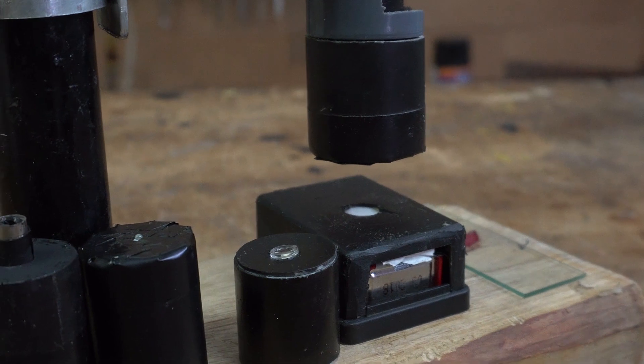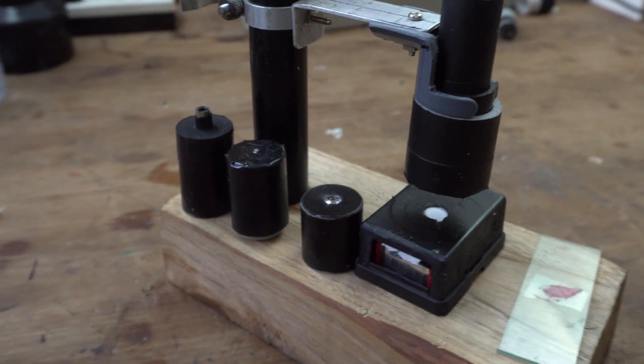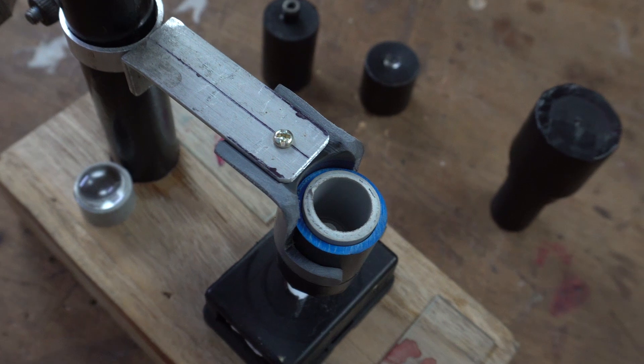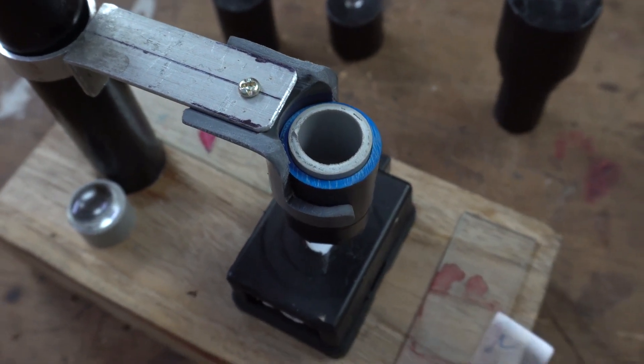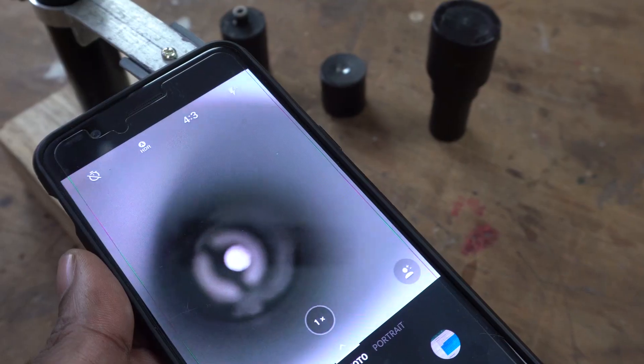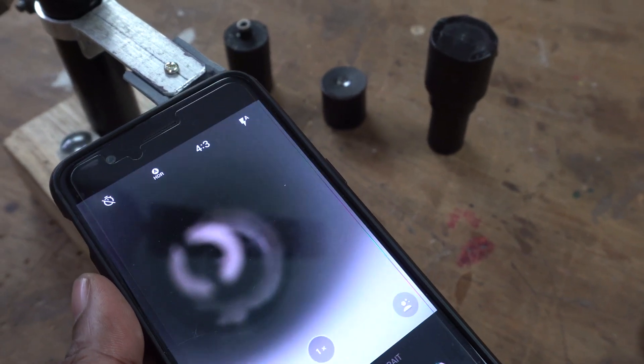Considering most of its parts are salvaged, this is one of the low cost but really educational projects. One upgrade could be made — adding a variable resistor in the light source to adjust its intensity — but I just added some papers in there. Unfortunately, I will not be able to show you what I see through the microscope on screen because the mobile phone does not do a good job of capturing the images through this microscope, and that may be because of the shape of the microscope itself. I needed some proof to show you that this microscope does work — this is the best footage I could get. But let me tell you that the view is much better directly.